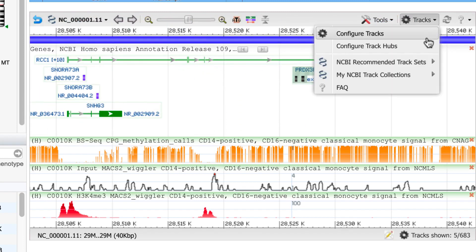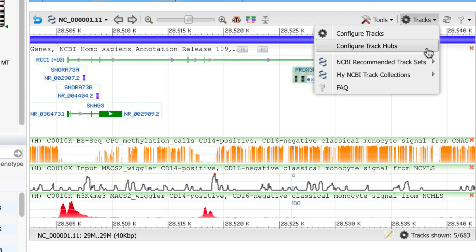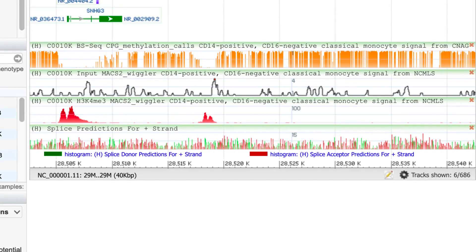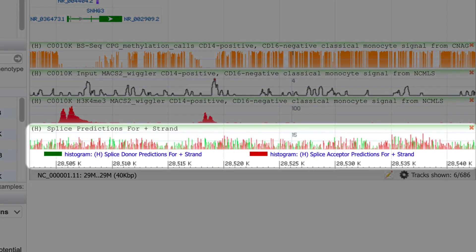To show a few more features, I'll go back to the Configure Track Hubs menu to connect to a different hub and select two tracks that display as a merged track. Here is that track, which combines data for both splice donor and splice acceptor predictions in green and red, respectively.